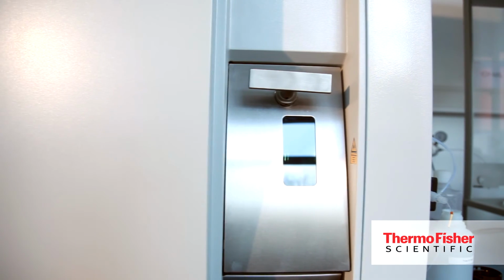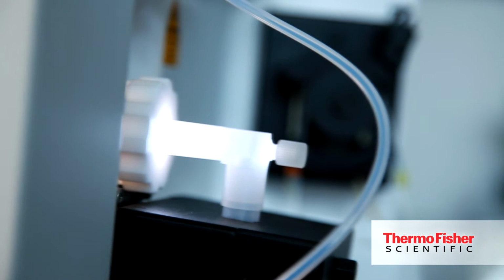ICP-MS, on the other hand, has a higher detection sensitivity and can therefore go lower. And in my recommendation, it would be the more future-proof choice if you want to select an instrument to go for. It's basically all about validation of the method.